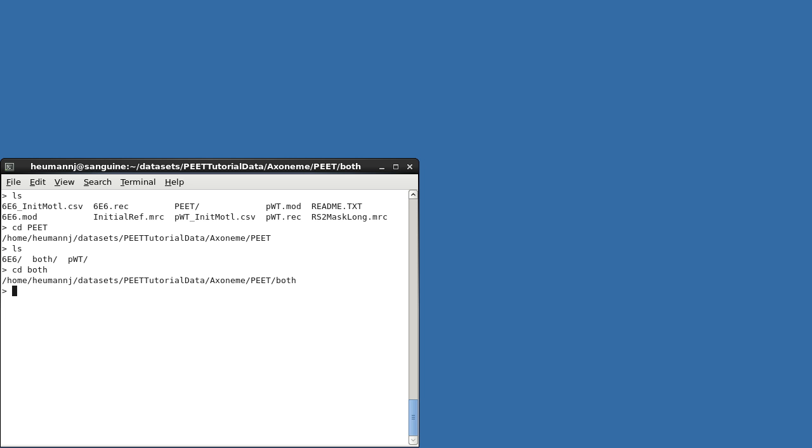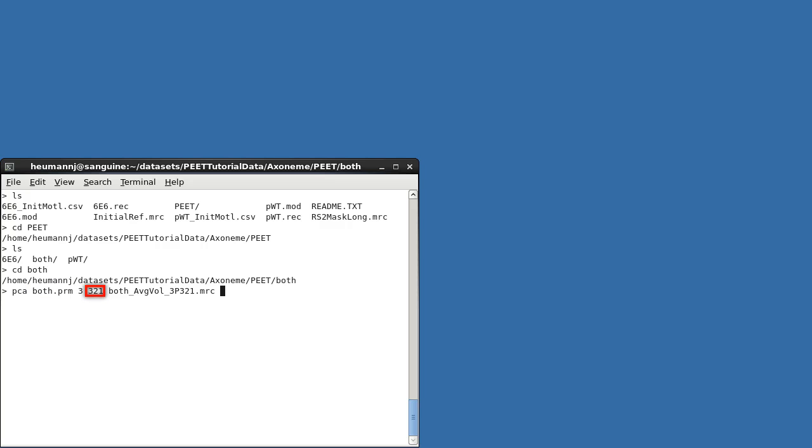CD-ing down into the both subdirectory, I'll run this program, PCA, using the existing alignment. Because we have a limited number of particles, I'll use all the available data. With larger datasets, you may wish to exclude some fraction to allow for misaligned or damaged particles. To run PCA, I'll specify the parameter file name, the final alignment iteration number, the number of particles to process, and finally, the average volume to take as an estimate of the true volume when performing missing wedge correction.